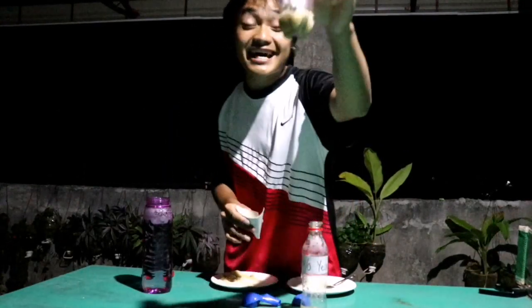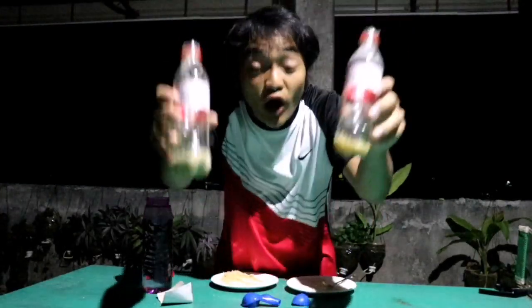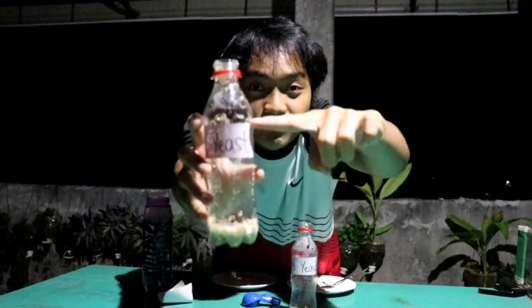Ayan, so, nalagyan na natin ng sugar and yeast yung with yeast, and sa without yeast ay sugar lang yung nalagay natin. So, let's move on to the next part. So, lalagyan natin ng warm water yung dalawang bote. So, itansya natin siya hanggang dito na part. Okay? Nakita ba? Yan. So, ngayon, lagyan natin.